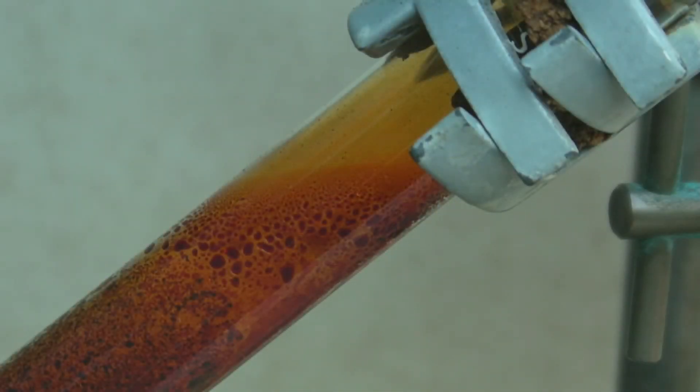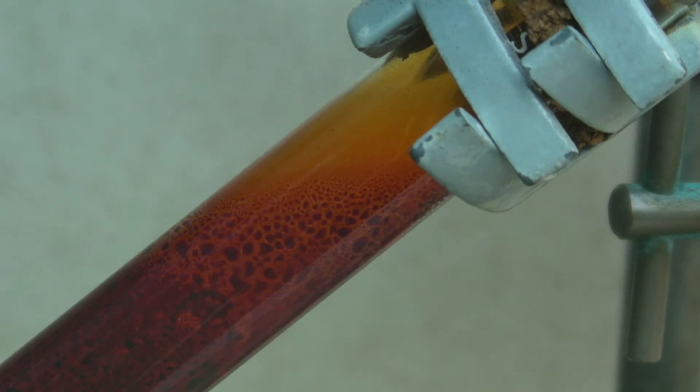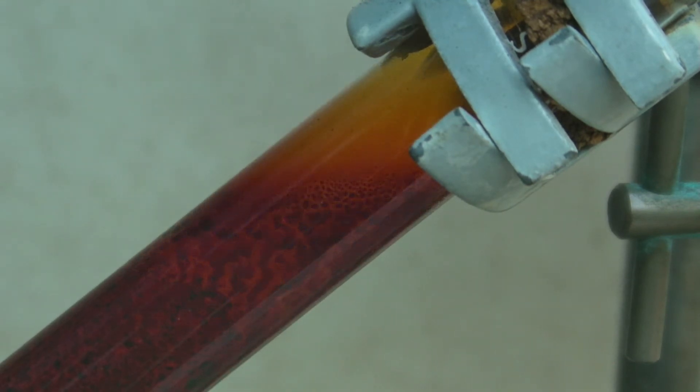Bromine has a boiling point of 58.5 degrees C. When drops begin to form on the inside of the tube, these can be driven up with a heat gun.